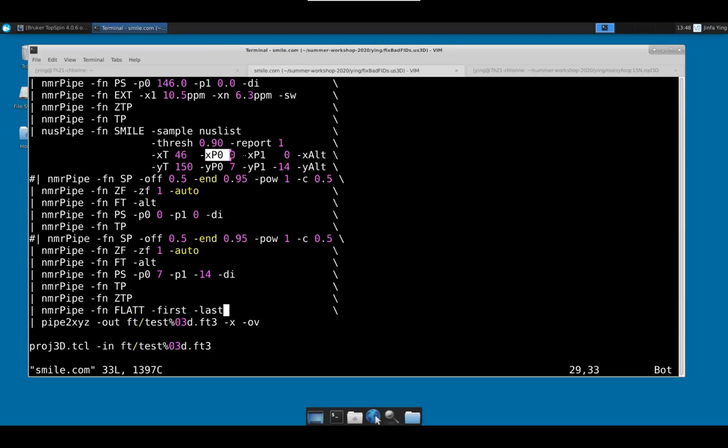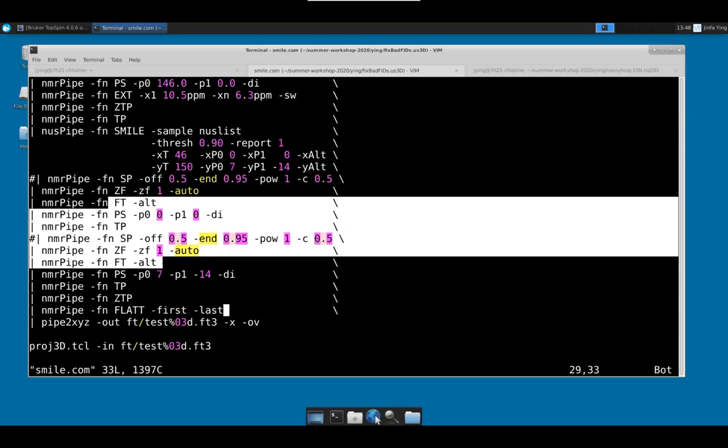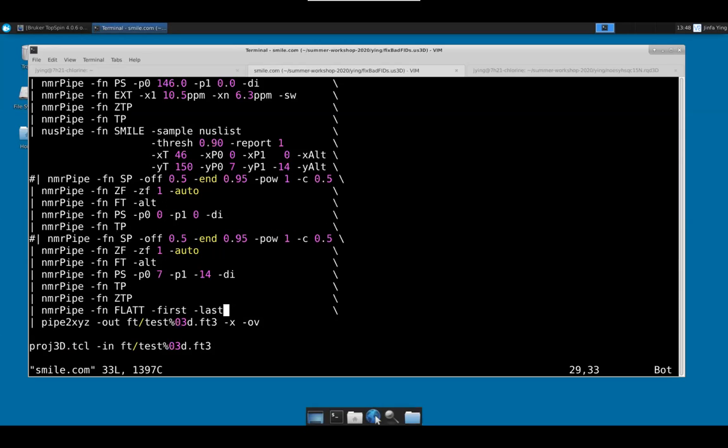Now, if it's just zero phasing, you don't need it, but I suggest it's good practice to keep it consistent with your regular FT processing, okay? And sometimes you have a negate, you also do X nag and Y nag, okay? These are the things that I set by default; you may not get optimal data, but you need some manual setting to get optimal processing, okay?